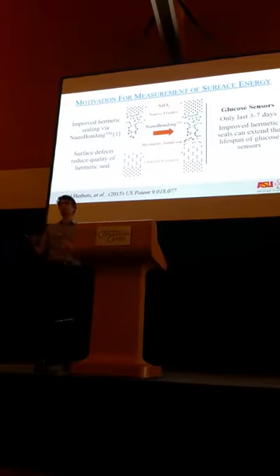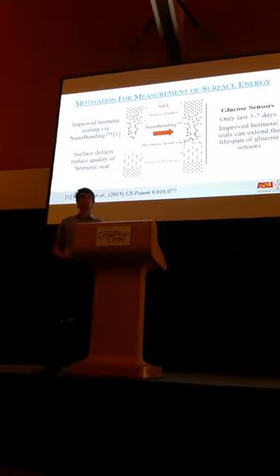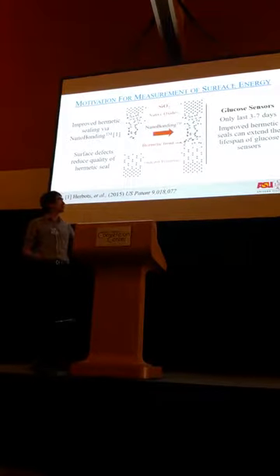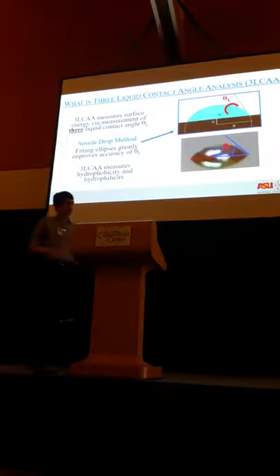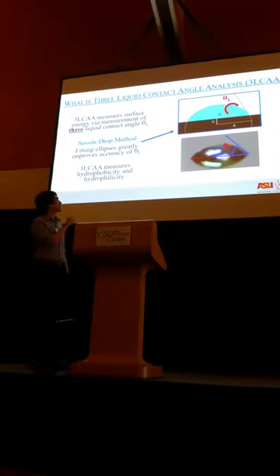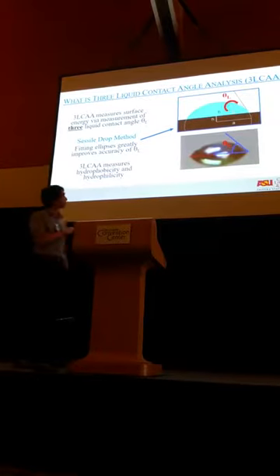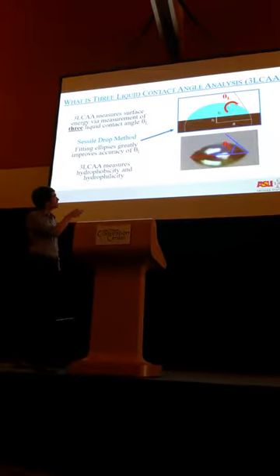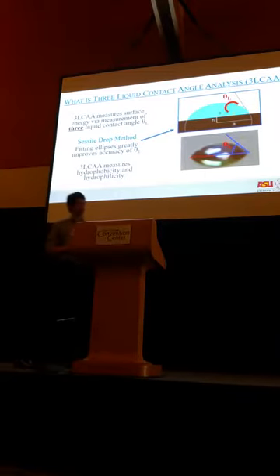If we could improve the hermetic seals in these electronic sensors, we could drastically increase the lifespan and reliability of these sensors without significantly increasing the cost or altering the means of production. We measured the surface energy of these materials via the three-liquid contact angle analysis method. The liquid contact angle is defined as the angle that the tangent line to the surface of the droplet makes with the plane of the material here. So here is our surface contact angle.